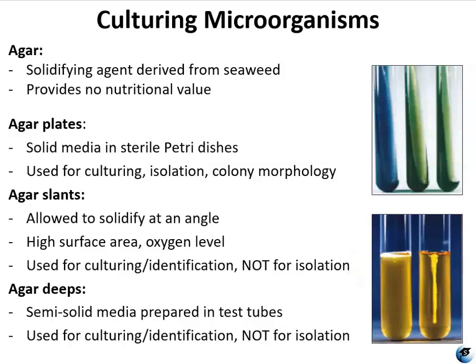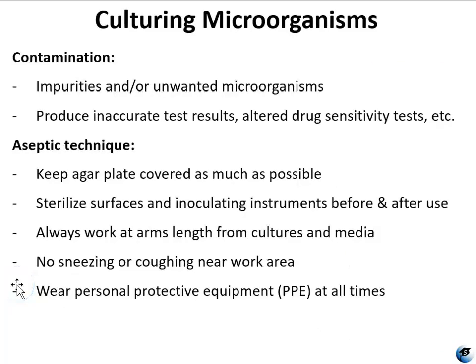Because microorganisms are ubiquitous throughout the environment, it's very important for students to learn early in this course how to use proper aseptic technique. You do already know about wearing PPE, but in addition to that, aseptic technique involves avoiding contamination of your sample, your workspace, yourself, others. And one very easy thing to do is to make sure that you keep all of your specimen and agar plates and things like that at an arm's length. And you want to keep everything covered as much as possible.